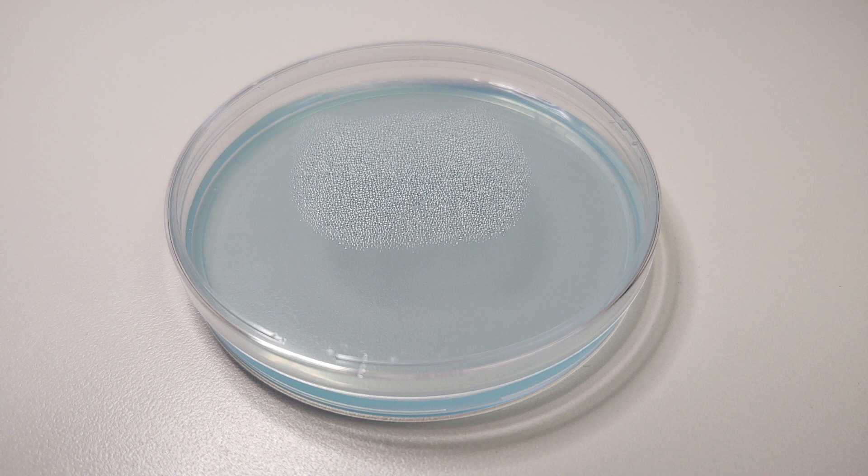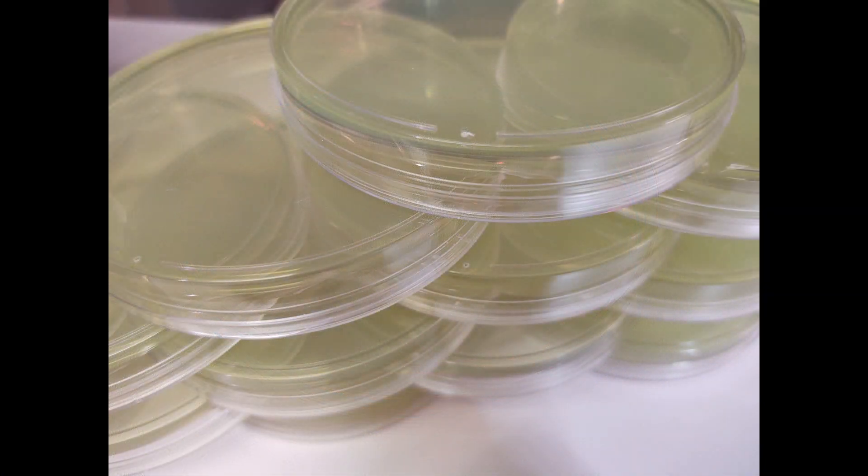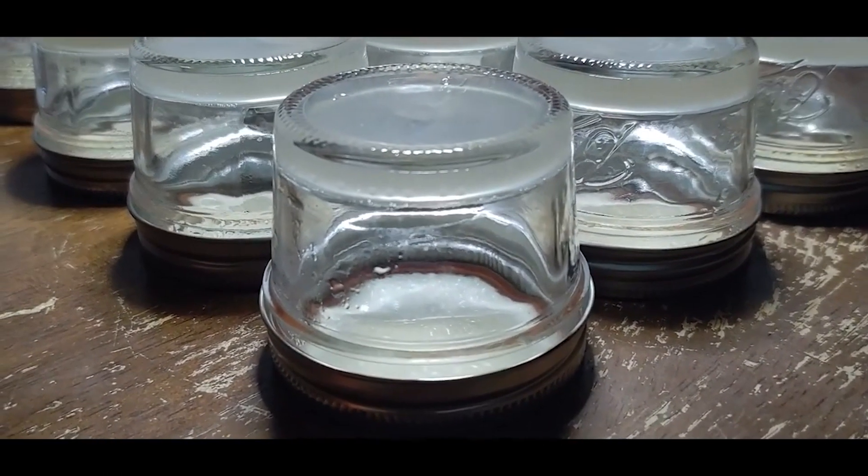Allow your plates to cool to room temperature. If you see condensation, just flip your plates upside down — you can even store them upside down. We recommend that you wait 24, 48, even 72 hours to make sure that your plates do not have any contamination.